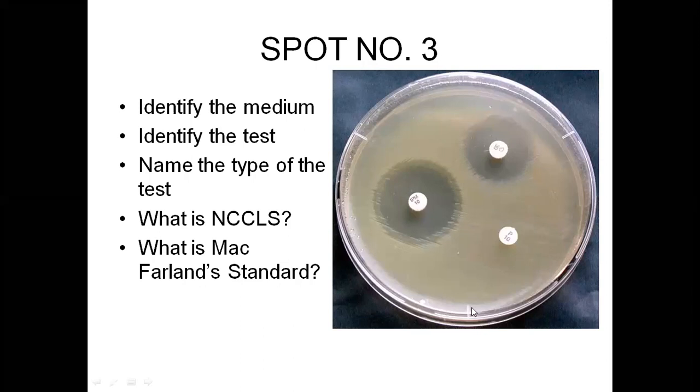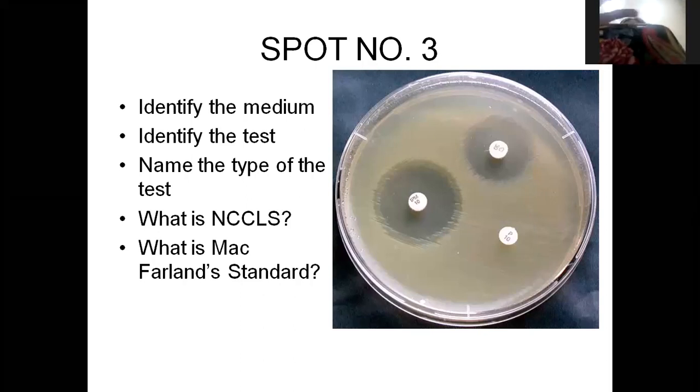Another technique is that if we take the colony and instead of spreading it on this agar, we are going to put it in a peptone water, dissolve that colony in that peptone water, and then drop or spread that peptone water on this nutrient agar plate. That is going to spread again on the whole plate like a uniform substance.